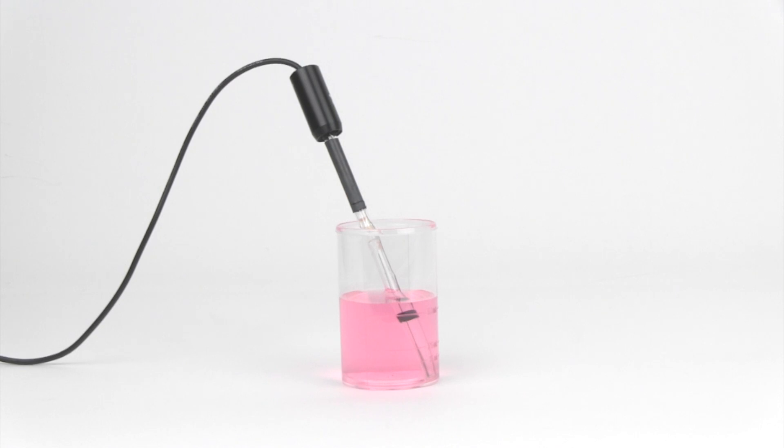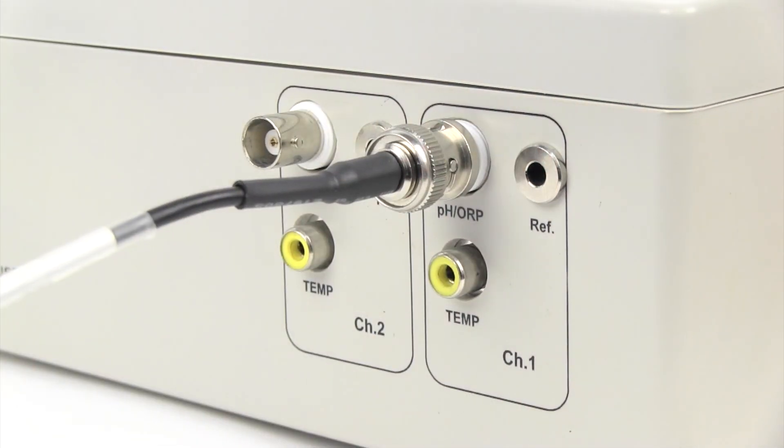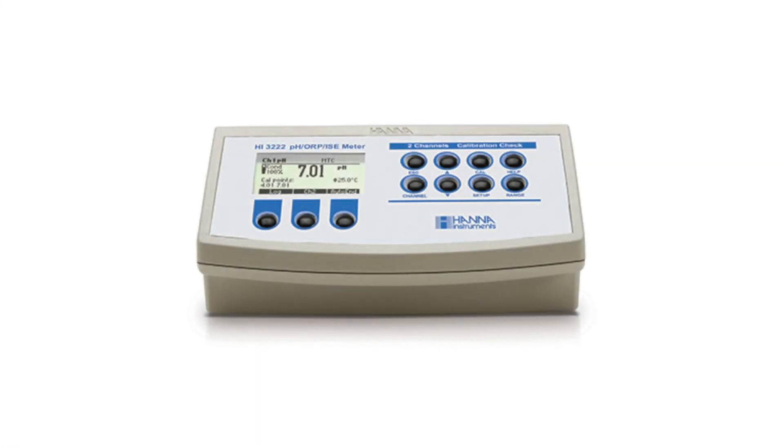The sensor should be submerged to the large black band on the internal sensor when checking or conditioning the electrode. Once the electrode is conditioned, we can proceed with the slope check. Connect the electrode to a meter that can display a millivolt reading. In this demonstration, we will be using an HI3222 meter.